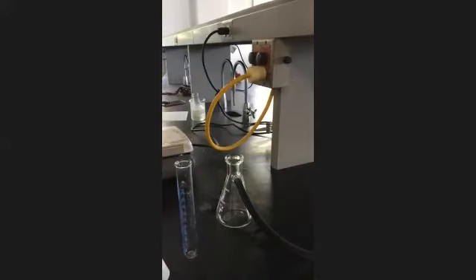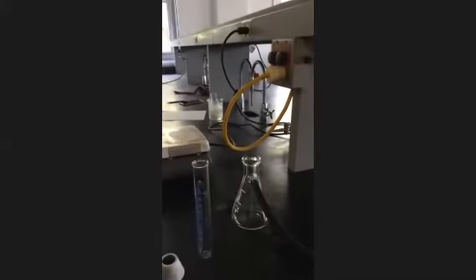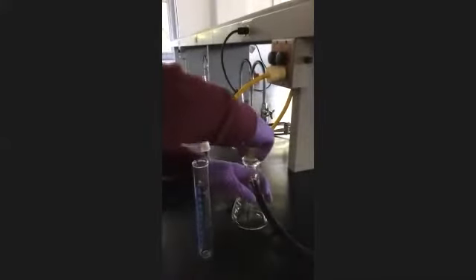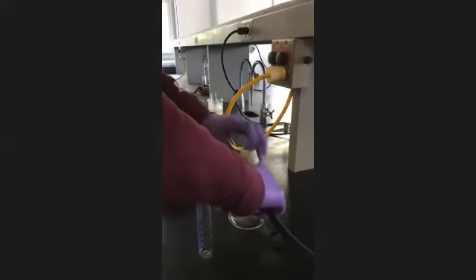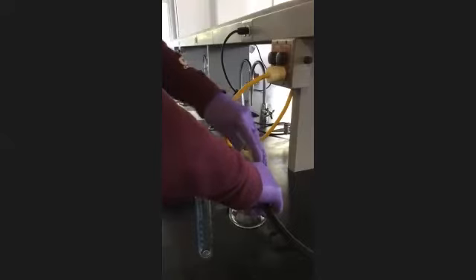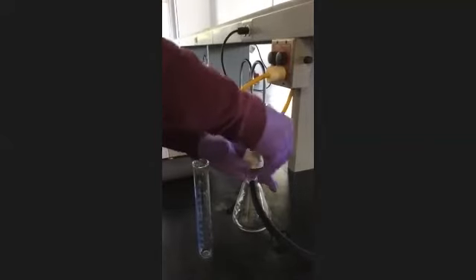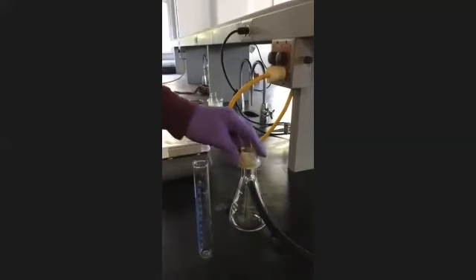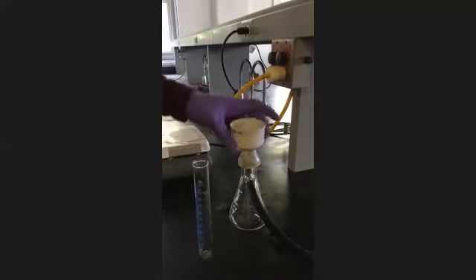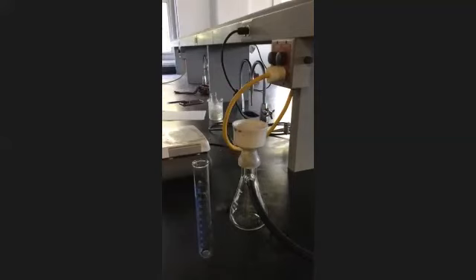Once the flask is set up, let's see if this will fit. That ain't gonna fit. I'm gonna turn it over. The reason I'm turning this the other way is because what you want to do is get a good vacuum, a good seal on there. So when you turn the aspirator on, it's pulling vacuum, right? Because when you filter it, you want to filter off the water and keep the solid. So we're gonna sit that on top like that, and that's your vacuum filtration setup.